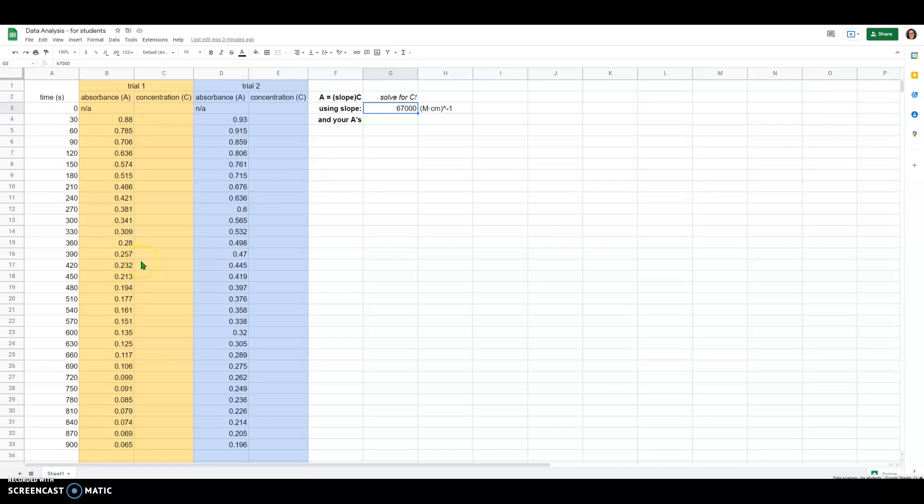This is going to be a demo of how to do the kinetics analysis for the lab that we just finished.